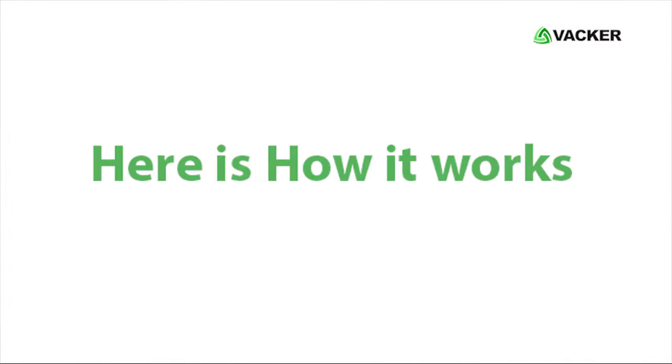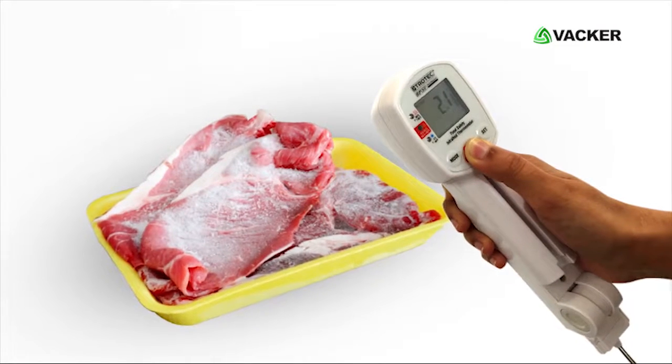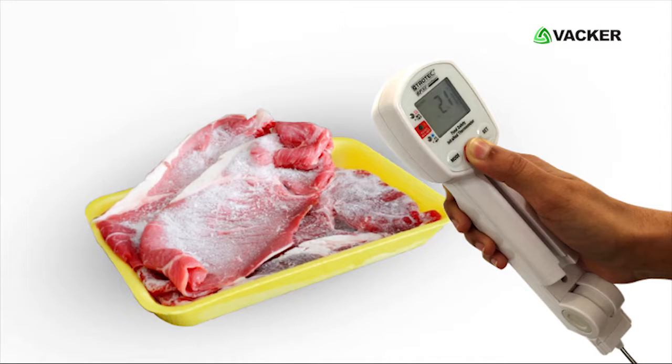Here is how it works. Using infrared: first, press any button to start the device. Press the Meas button continuously by pointing the device towards the food to obtain the exact temperature.